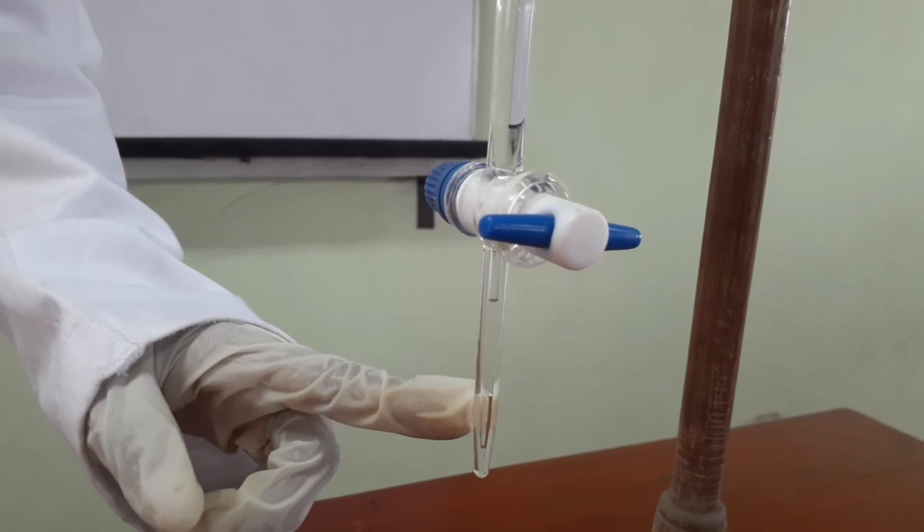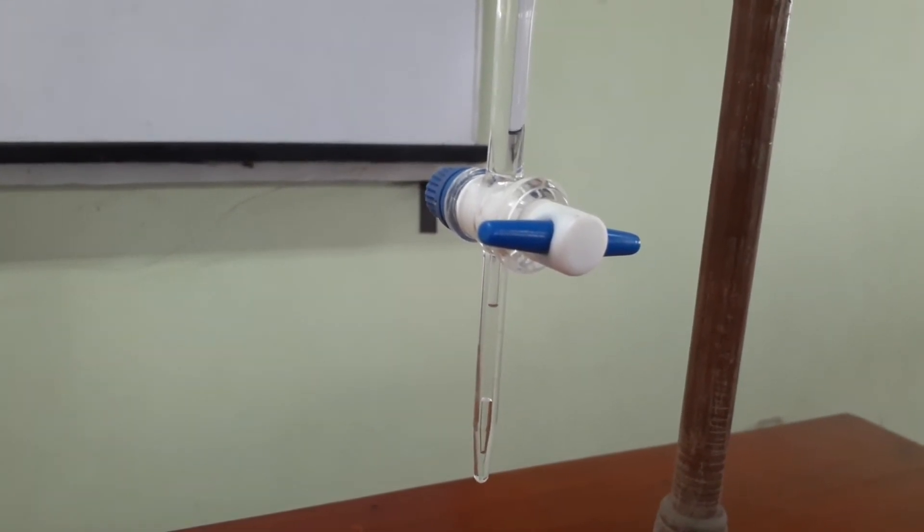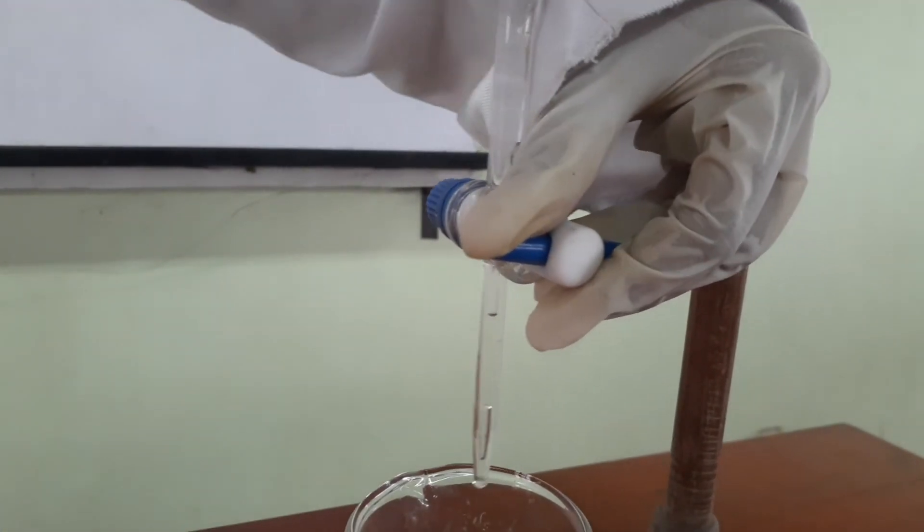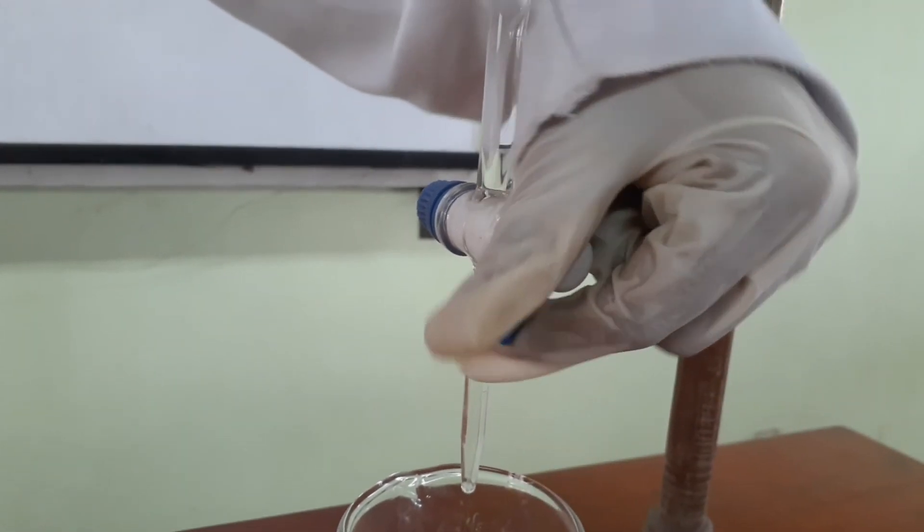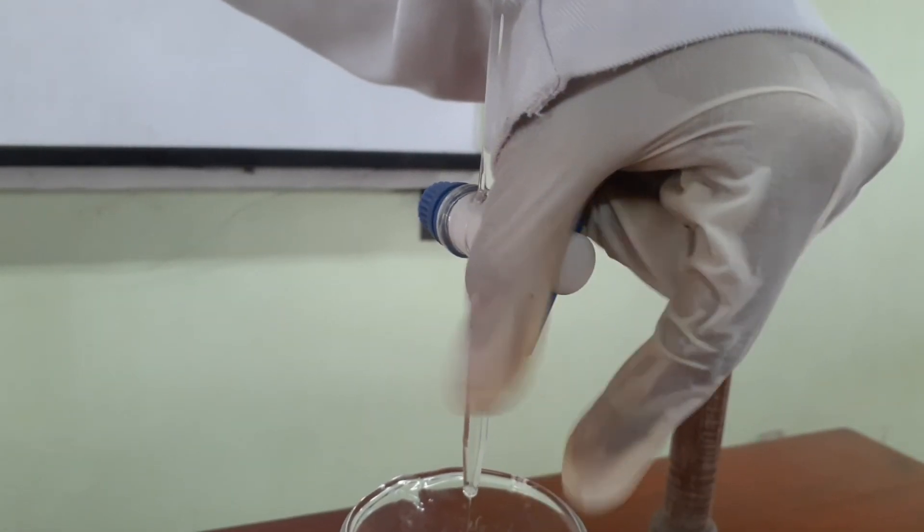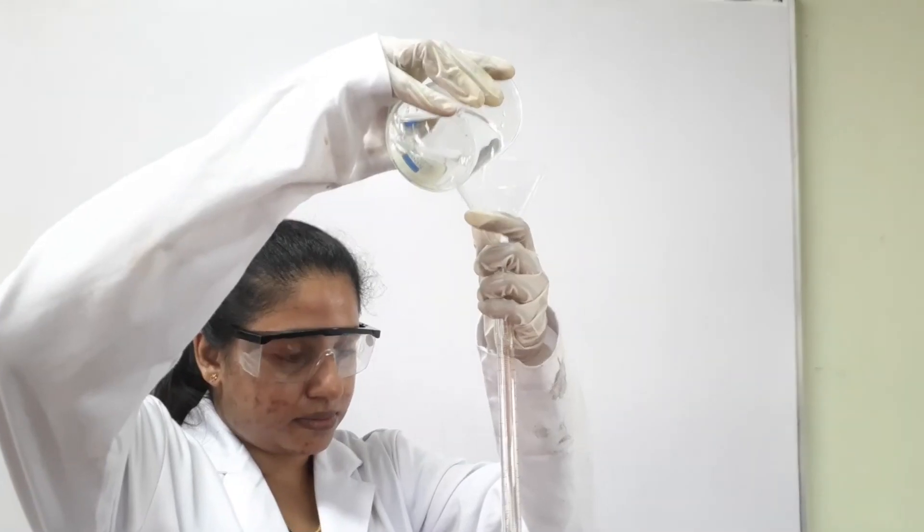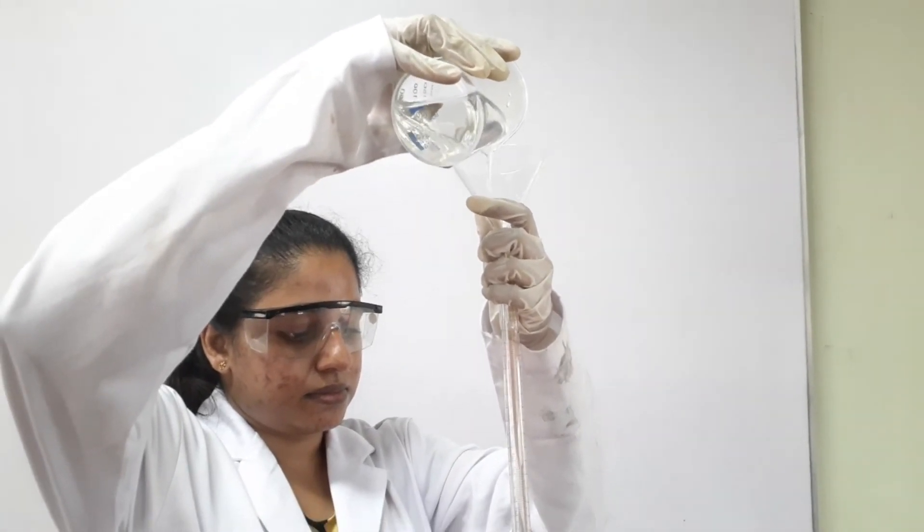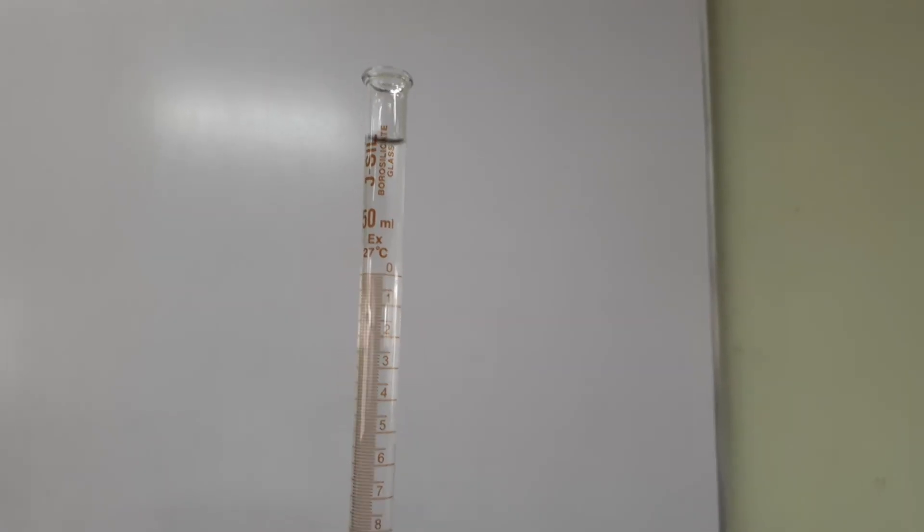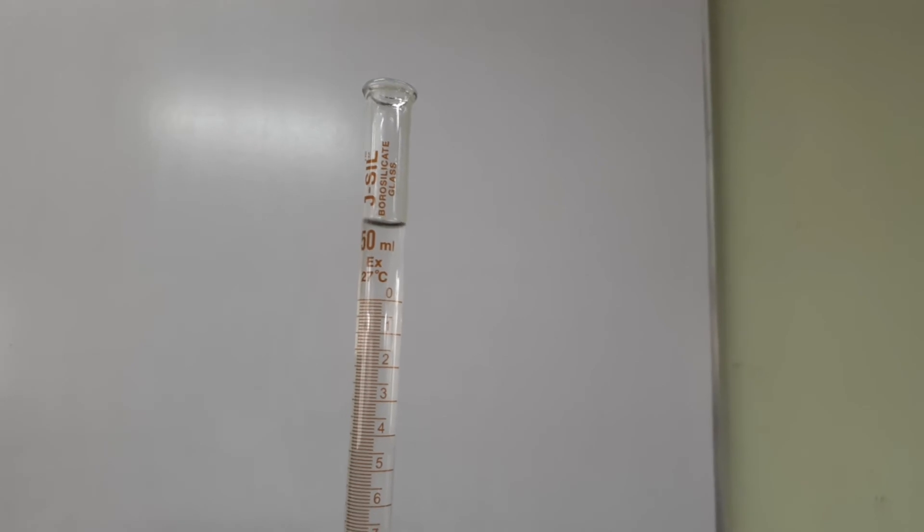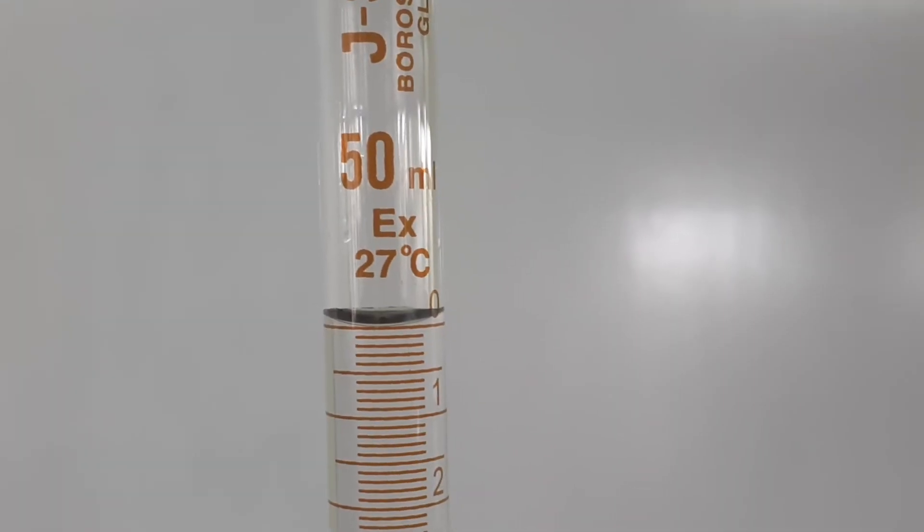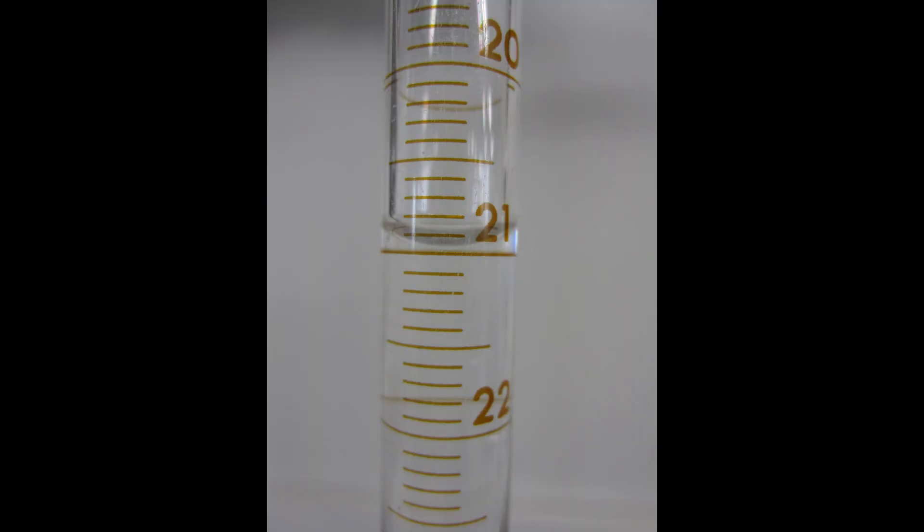If there are any bubbles in the burette, we need to remove them by turning on and off the tap very quickly. Once air bubbles have been removed, the burette is refilled with solution. At this point, the burette tap is opened and we let the solution run out until the lowest part of the meniscus is level with the 0 graduated mark. We always read a value at the lowest level of the curve. Here the reading is 21 ml.